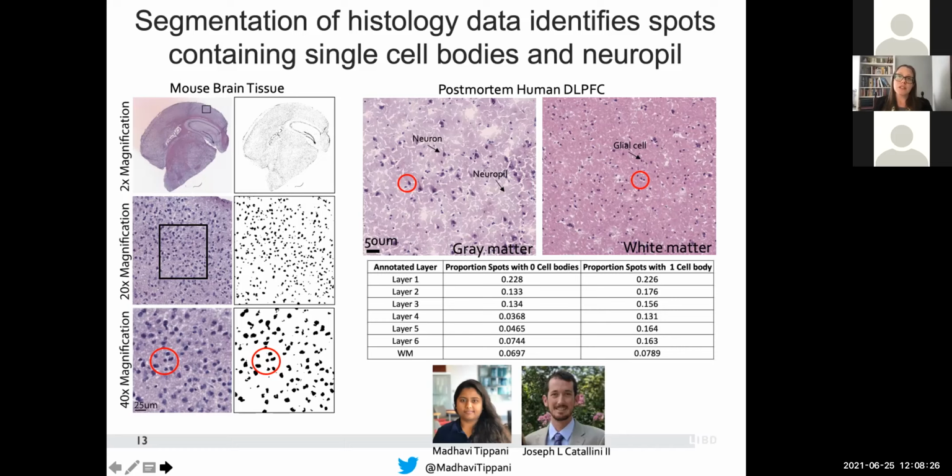So we're very interested in leveraging this histology image data and quantifying other parameters such as cell size, shape, or other unbiased features or patterns that may not be biologically obvious for integration with gene expression data. And again, this is another opportunity where machine learning approaches may be able to extract new types of meaningful information from the images that we can then overlay or incorporate with cell and region-specific gene expression to build more integrated anatomical and molecular atlases.